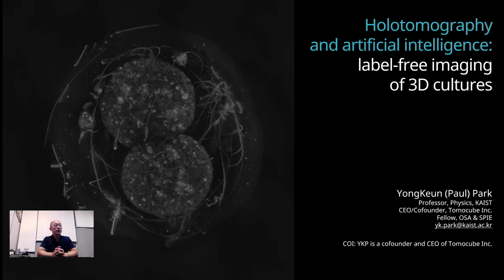My name is YongKeun, professor in physics, and today I'd like to talk about quantitative phase imaging, three-dimensional quantitative imaging, which is called holotomography, and how we can use HT and artificial intelligence for three-dimensional biology and various new fields of bioimaging.